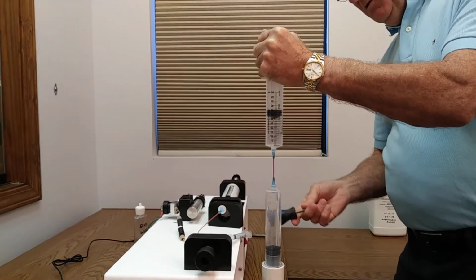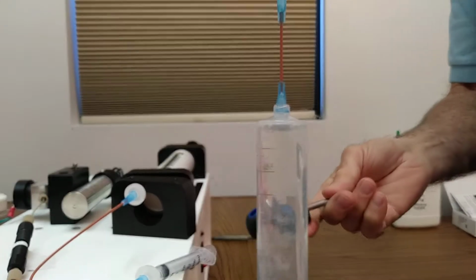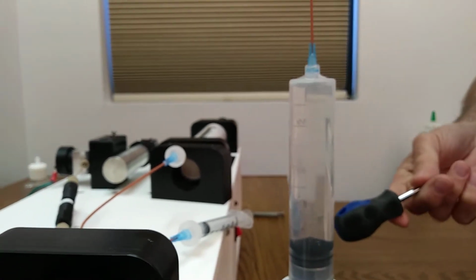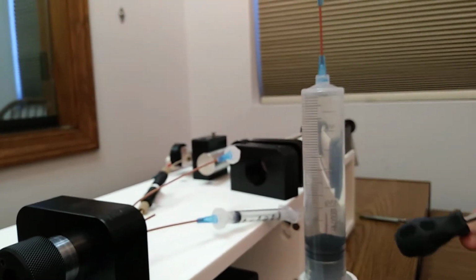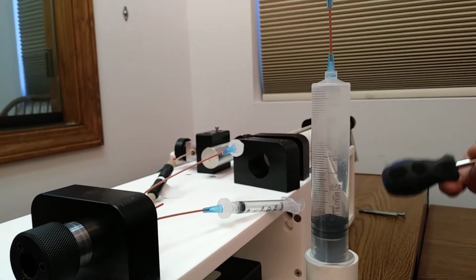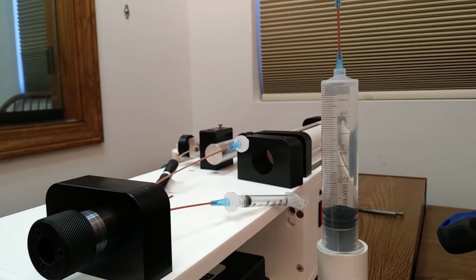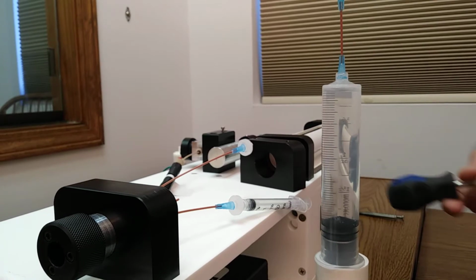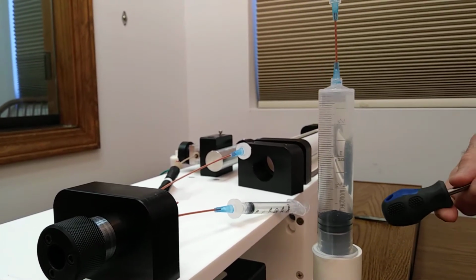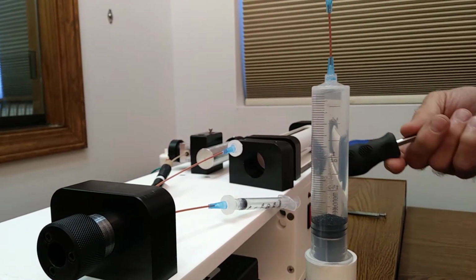Air dissolves in organics very well, and much of the eluent is organic. So I just keep tapping it. And for some reason the mechanical shock wave going through the liquid makes the gas turn loose. You can see it's going up in there, and this actually meets the definition of boiling. So we do this, typically it takes about a minute to get all of the gas out. The gas is air, of course.